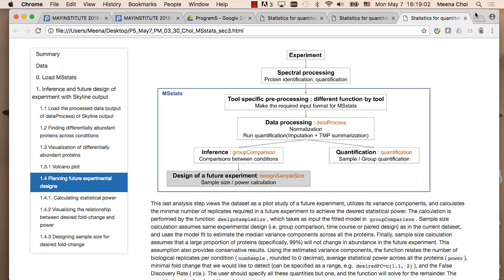You can use this output for another analysis, like cluster analysis and so on. We are going to use this one for clustering or classification analysis on Wednesday morning.